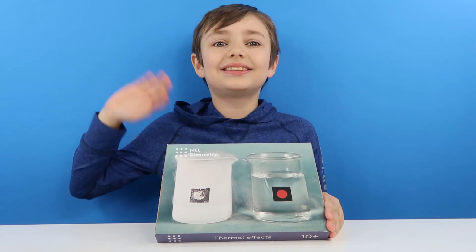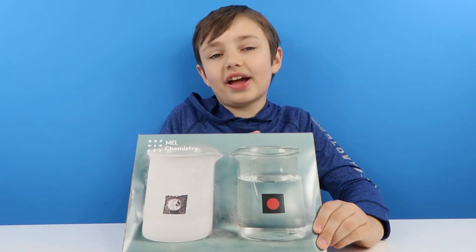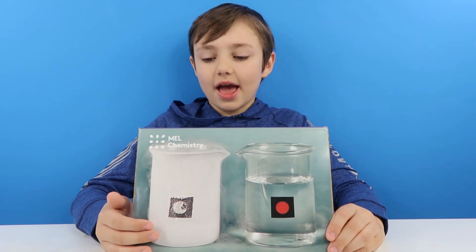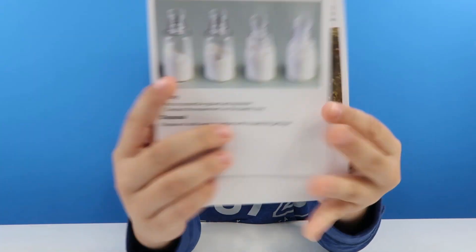Hi guys! Today we've got some more MEL Science, and today we have got the thermal effects pack. We are going to be doing chemical warmer and crumpled bottle — first we will do chemical warmer and then we will do crumpled bottle.